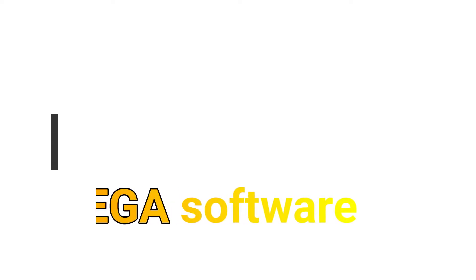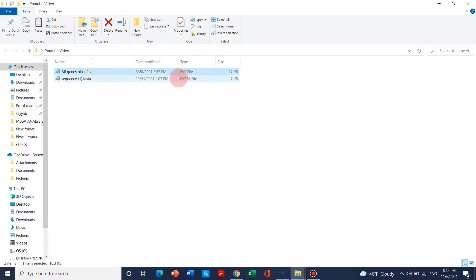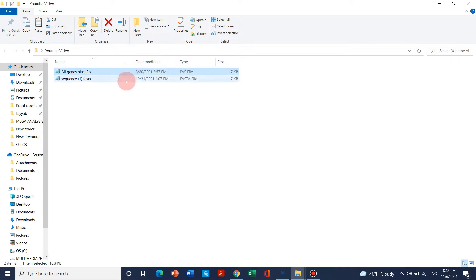Welcome to another video tutorial. In this video we will learn how to do phylogenetic analysis of protein or your desired genes. In the previous video we have already downloaded these sequences. If you don't know how to download these sequences you may watch the previous video of this series. So in the previous video we have downloaded these files from NCBI. Let us start with these files and do phylogenetic analysis.